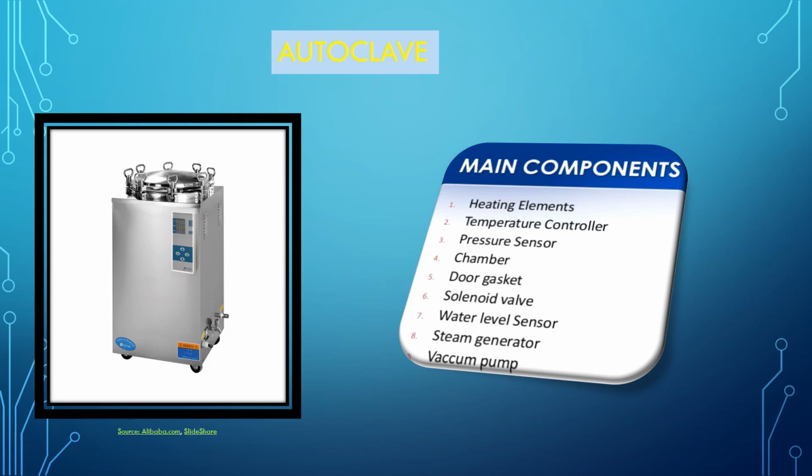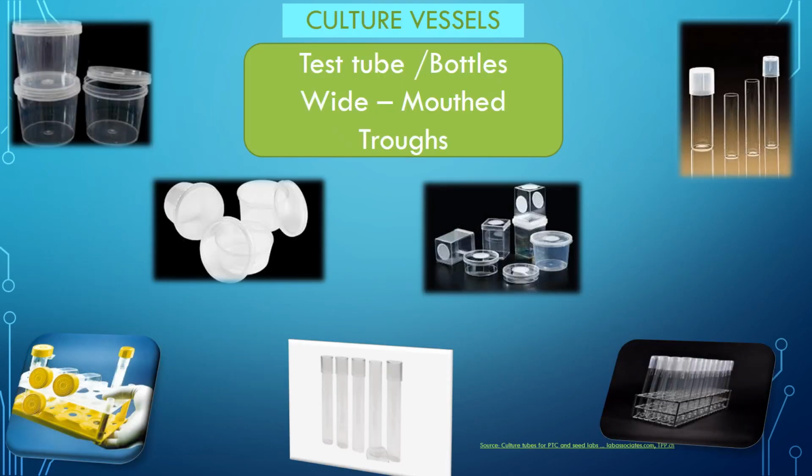The solutions and the culture vessels used for plant tissue culture are generally sterilized using an autoclave. But temperature sensitive components in solutions, like growth promoting hormones, should be filter sterilized and should not be autoclaved.